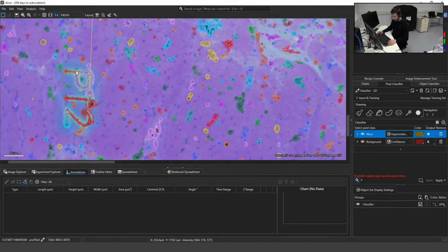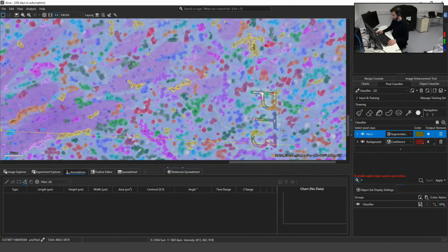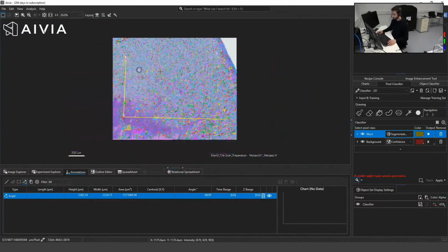Again, T, and from there I go to reference point 3, again in the middle of the T. Okay, so these are now the reference points.